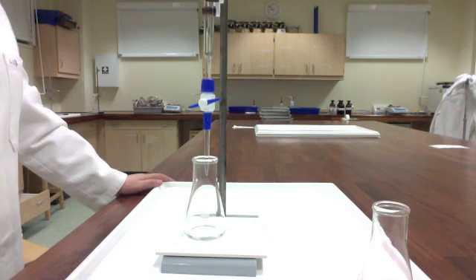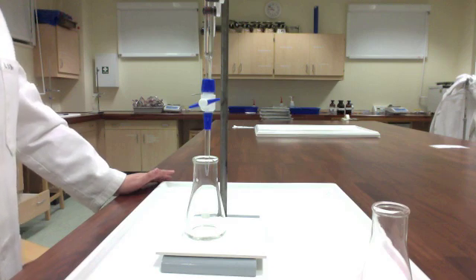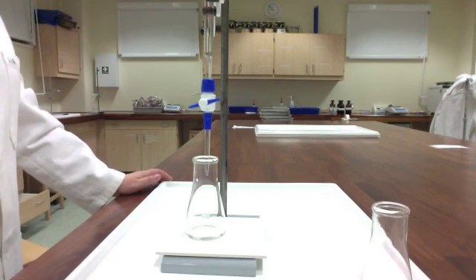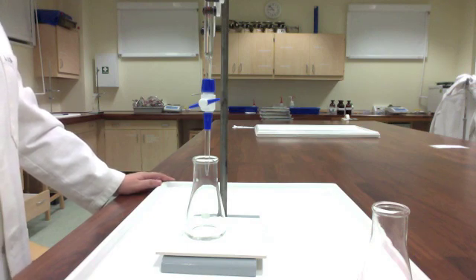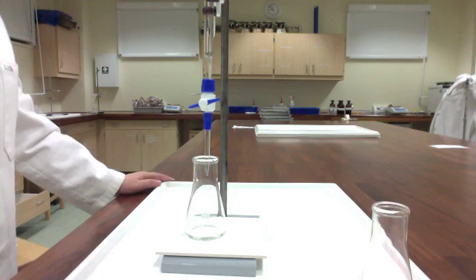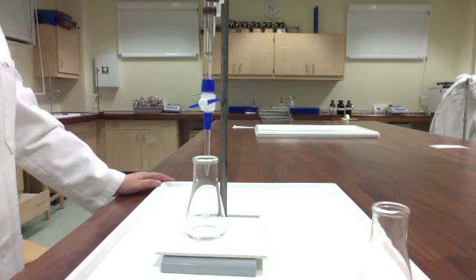All right, so I'm all set up to do my first good titration. It's my second trial. This should be my first good one. I hope. In prepping my sample, again, I pipetted 10 milliliters of my desired sample, in this case, KHP, and I put in about four drops of phenolphthalein indicator.